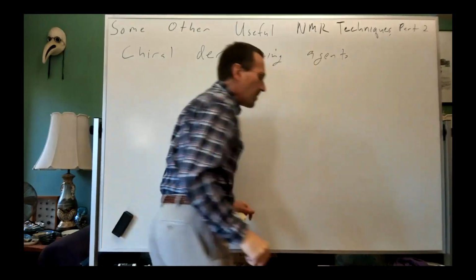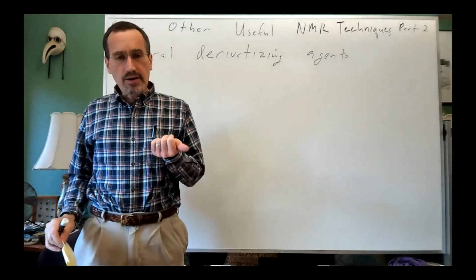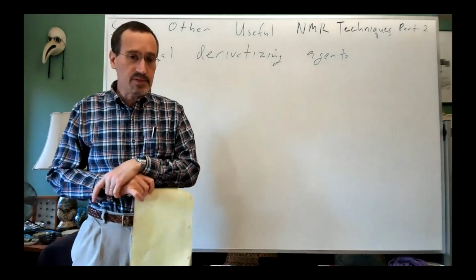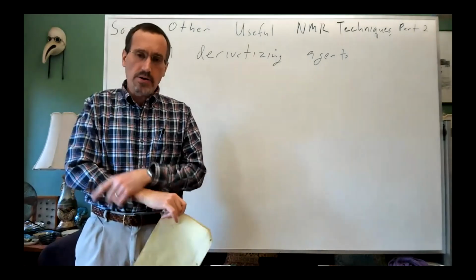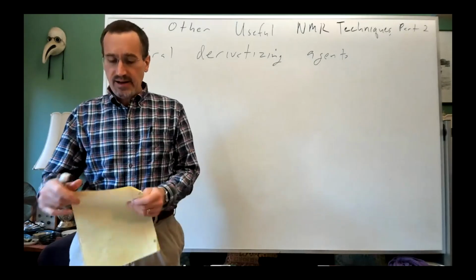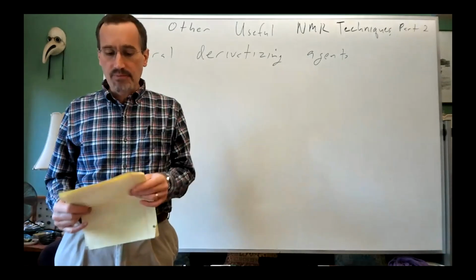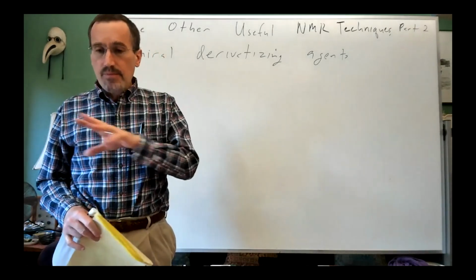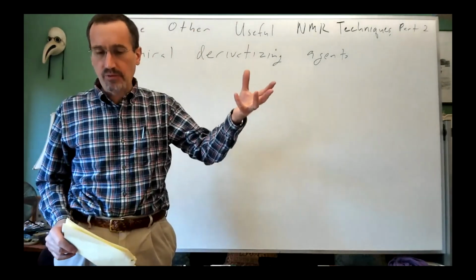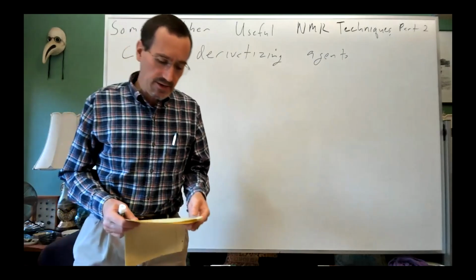And as I said before, and as we've mentioned in the course, an R compound and an S compound, enantiomers, have the exact same spectra. You can't tell an R enantiomer from an S enantiomer by NMR, and you can't tell that from a racemate by NMR. NMR is achiral, and it takes some type of diastereomeric interaction, whether external like a chiral shift reagent or internal like a diastereomer, to get distinction of signals.